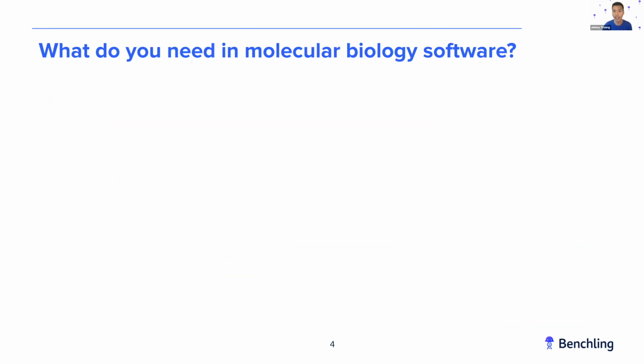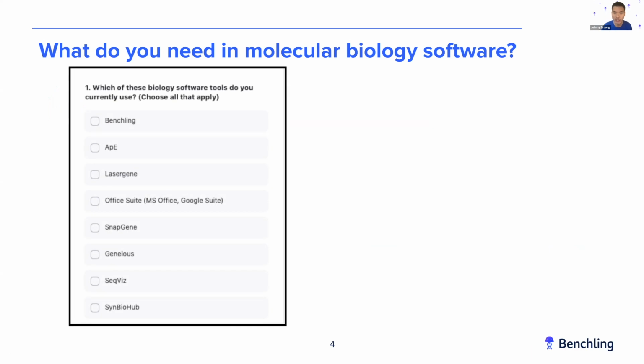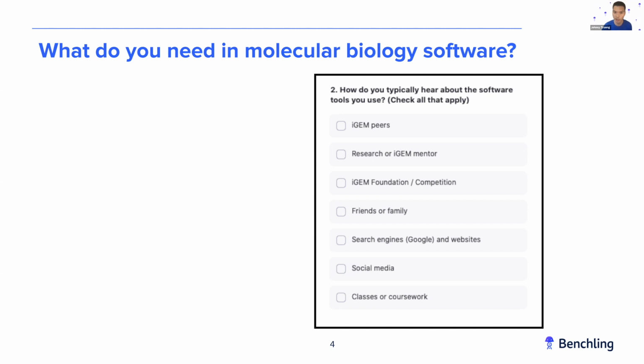So now before I go any further, I actually do have a few questions for you all. So I'm going to actually start by opening a poll and getting some responses from you all. We're really curious about some of the biology design software you're using today, and additionally how you have heard about them. We really want to understand how you think about using new tools and really what spurs you to make those changes. So you'll see there's a series of 2 questions. Feel free to just answer for all of those that really apply to you. So just take some time to read through. I know it's kind of a lofty question, but really, really interested to see what you all think.